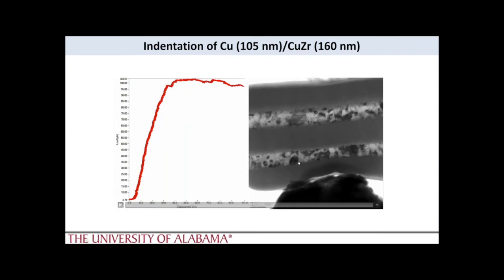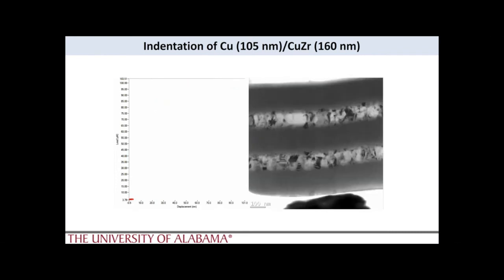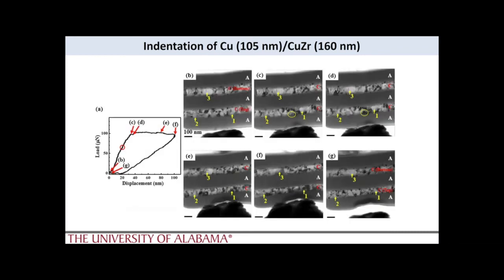Why are certain grains coming into contrast? Why are some going out of contrast? Why are some grains maybe changing their size or their shape? So again, what we do is compare it to a series of still images, as we would normally do in this type of bright field experiment, at different areas along the load and displacement curve.